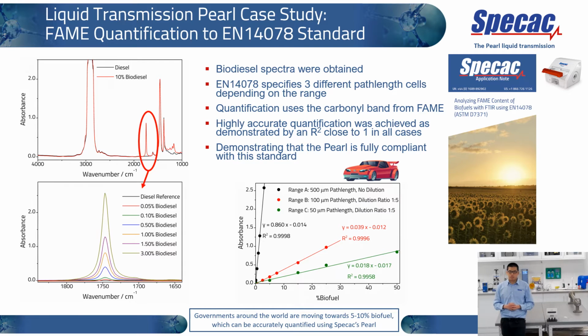In this application, we look at the FAME quantification in accordance to EN 14078 standard. So FAME stands for fatty acid methyl esters. And in this standard, we're looking at quantifying the carbonyl group using 3 different oyster cell path lengths.